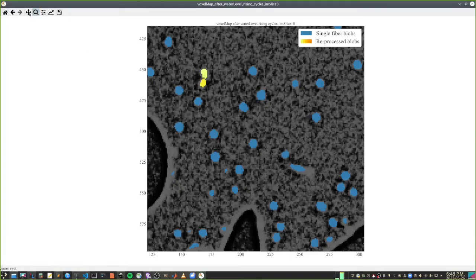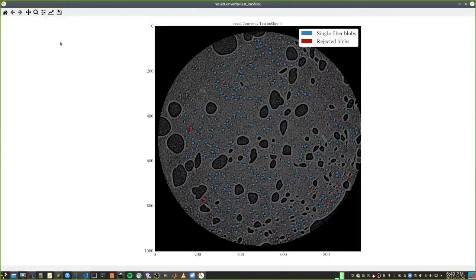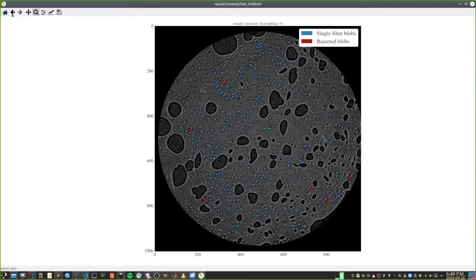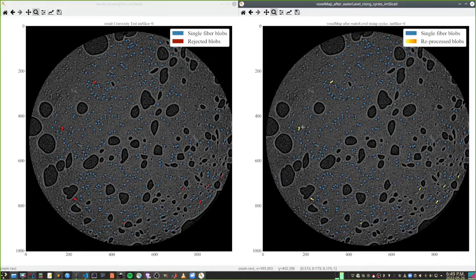The objective of this is, actually I'm showing you the result here, but if I go to the previous one, this is the output of the machine learning, and it found that this region was not convex. From there, it divided them again.